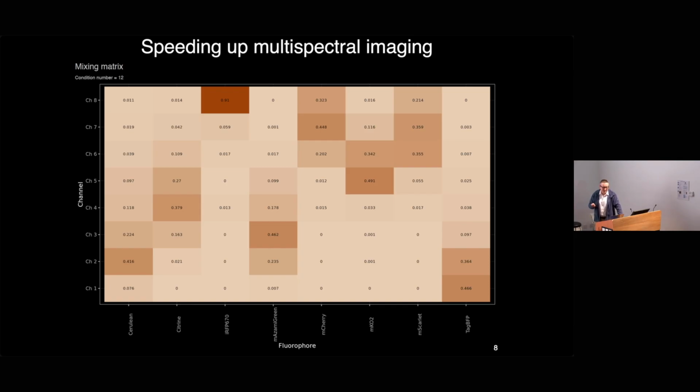The nice thing about having 8 channels is that before, we had a single point that was scanned and the light split onto 32 detectors, then we move to the next point and the next point and the next point. And so this is quite slow, and it also means you've got to put quite a lot of laser power into one focused point. With 8 channels, you could imagine that you would just about be able to get 8 cameras running together and detecting all that signal from the entire field of view in one go.